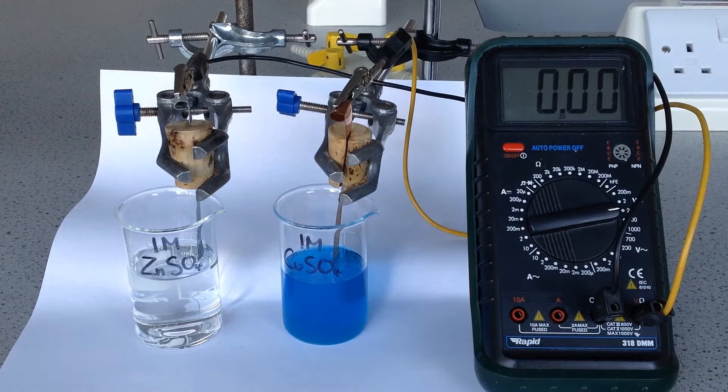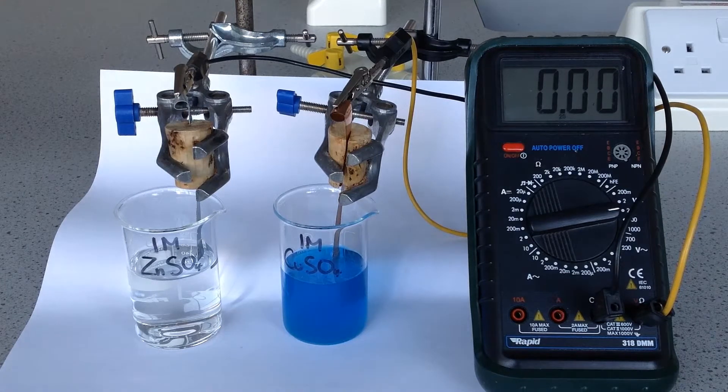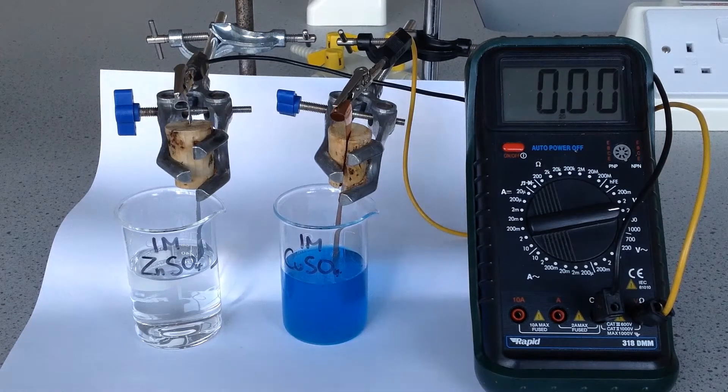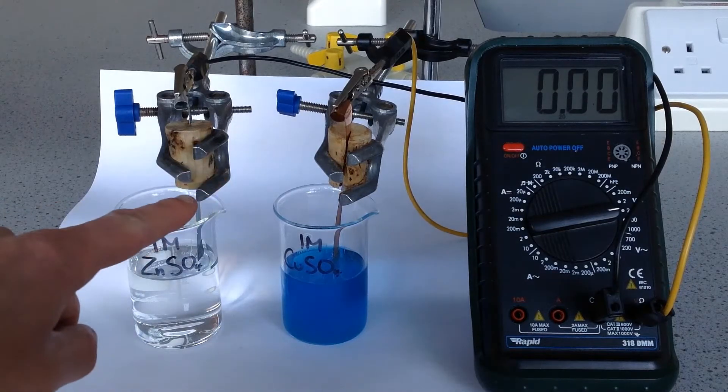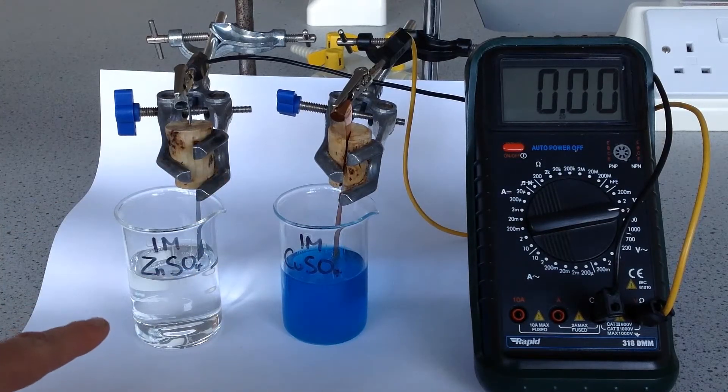In this video we have two half cells that we're going to connect to form an electrochemical cell. We've got one mole per decimetre cubed zinc sulphate here with a piece of zinc in, so that's a zinc zinc two plus half cell.